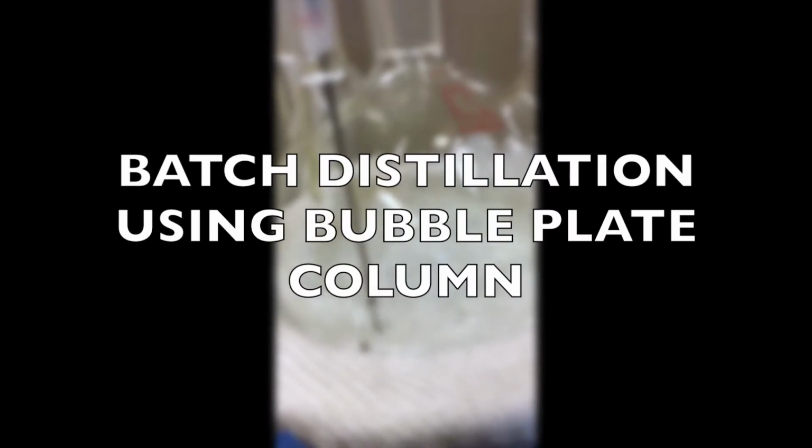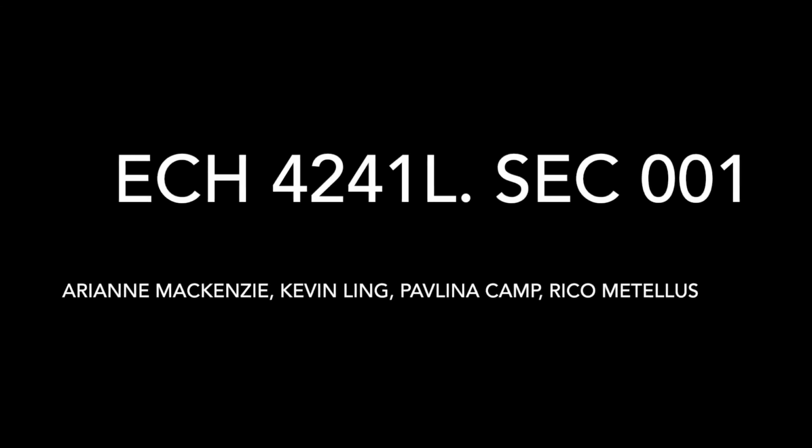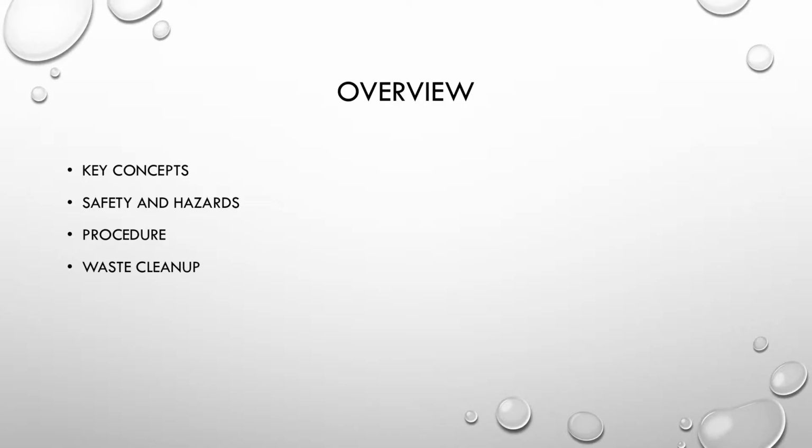Hello chemical engineering fanatics. Today's lab is batch distillation using a bubble plate column. The objective is to have a successful separation of ethanol and water using batch distillation. We'll be going over a bit of theory that's related to the distillation, as well as safety and procedure and waste cleanup.